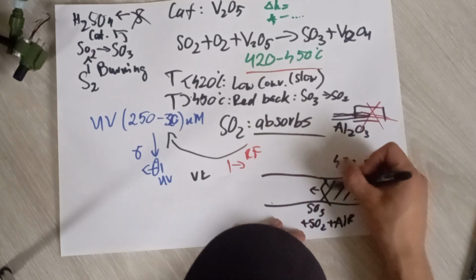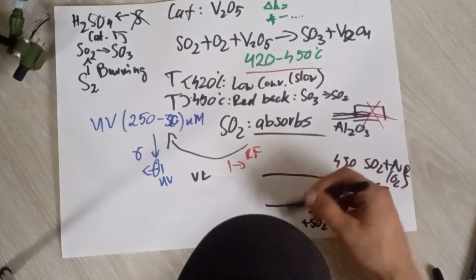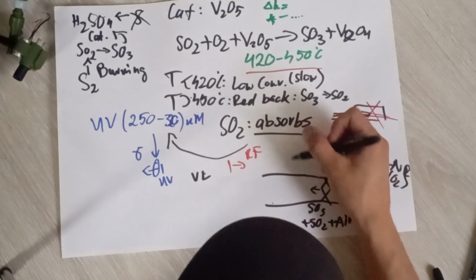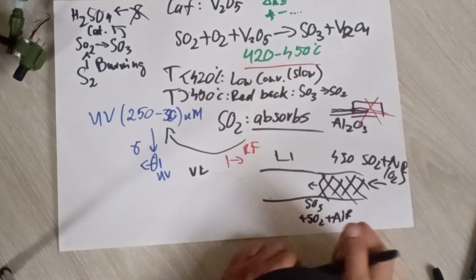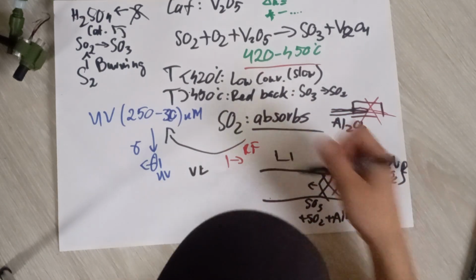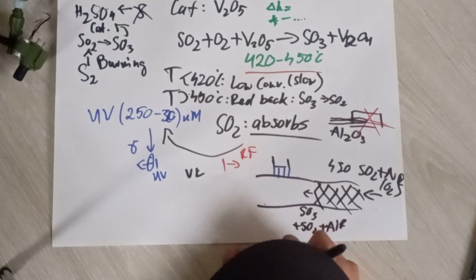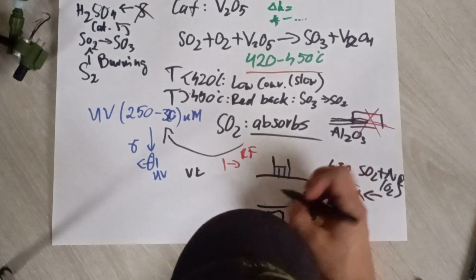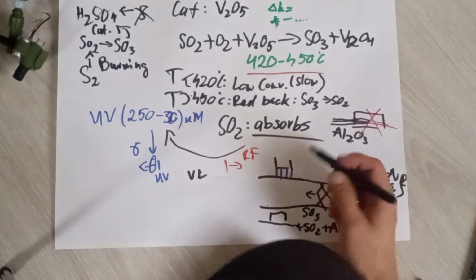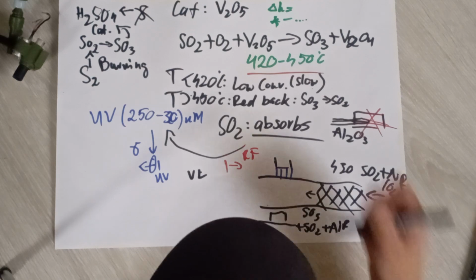So this is the catalyst here. And after that, we have a UV light that generates light through here, and it has a UV-absorbing photodiode on the other side, which is quite sensitive to UV and only to that.